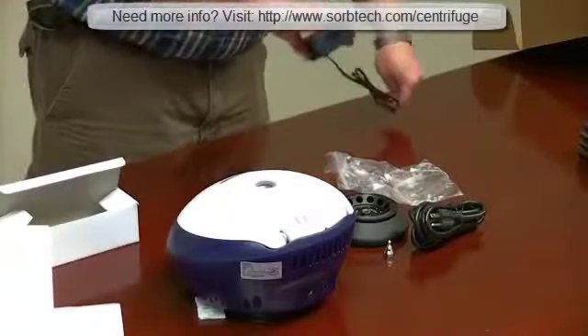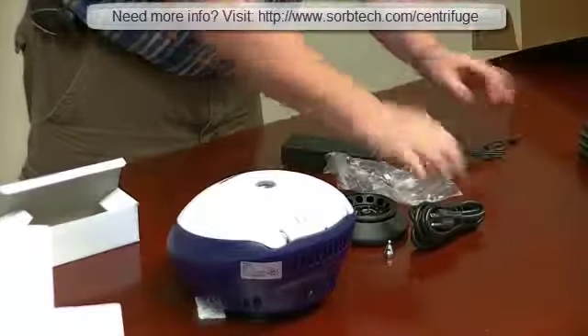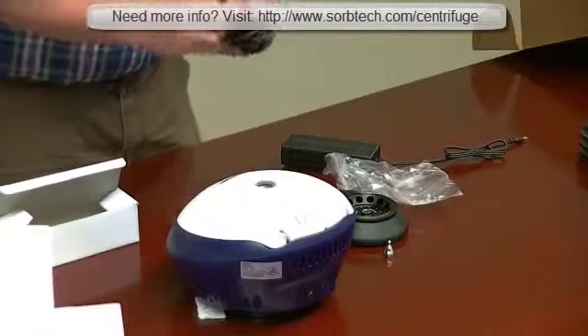This micro-centrifuge has a DC motor, so it has an adapter. That DC motor makes it very quiet.